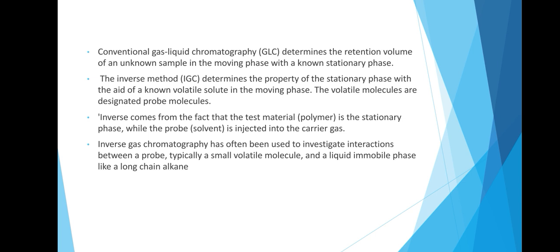In the case of polymer blends, the probe or the volatile molecules can be swept through the column much faster, according to the rule of mixtures, if a strong interaction exists between the considered polymers. Inverse, the name, comes from the fact that a test material or the polymer is in the stationary phase while the probe or the solvent or the volatile molecules is injected into the carrier gas.